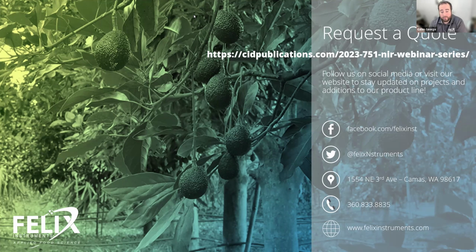Because what we want to do is standardize the analytical measurement that is done, because all over the world, everybody performs their analytical testing differently for any given commodity. There's really not a lot of standardization for how fruit is tested. So we are trying to make sure that our customers using our device are all using a standard method, because if they're not, then they're going to perceive that their analytical method is different from what the device is predicting.